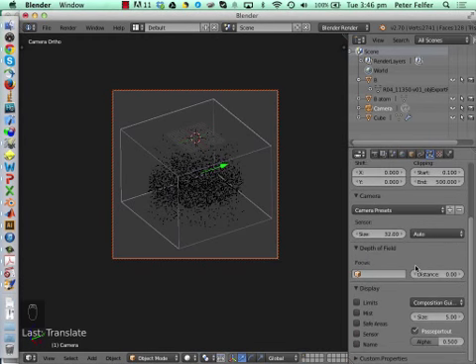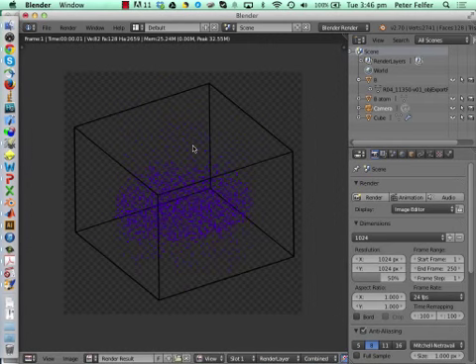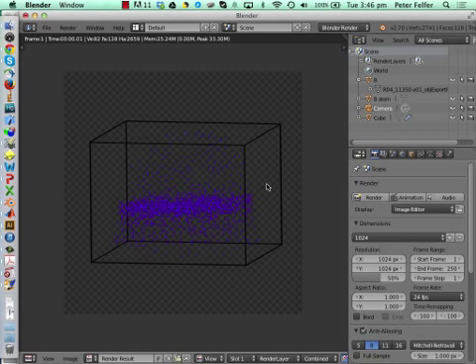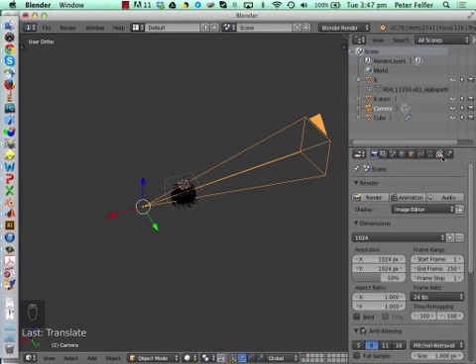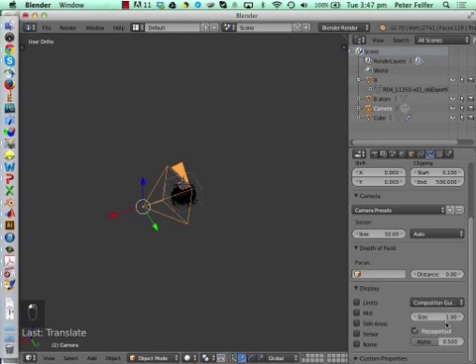And we're not going to use any of the more fancy options. So if you go and render it out now, you get the orthographic effect, and that's probably a little bit better for a publication. You'll see the grain boundary a bit better if you do it this way. And so much for the visualization. Well, maybe we've made that a little bit long, so we can make the size of the camera a bit shorter.